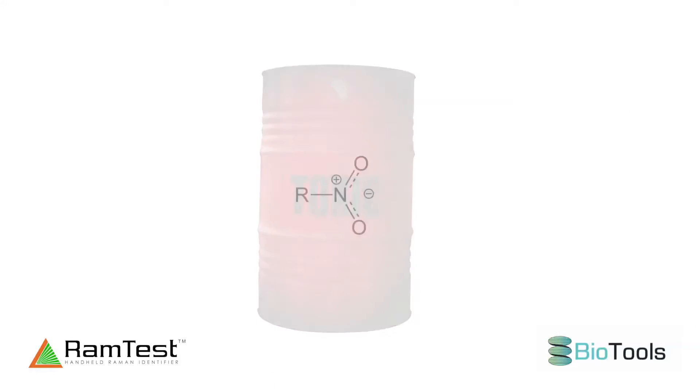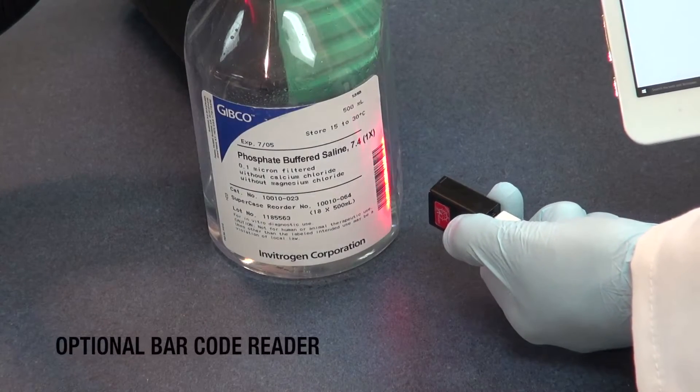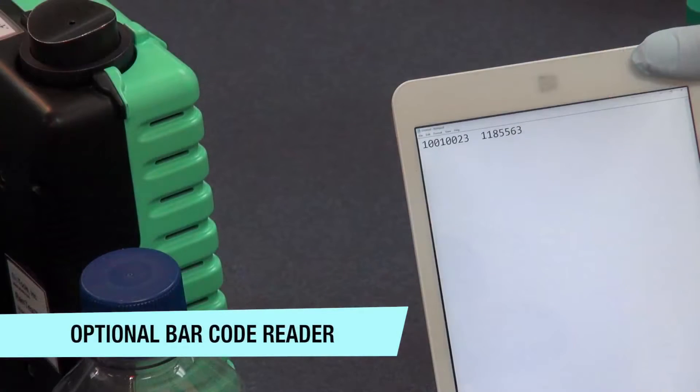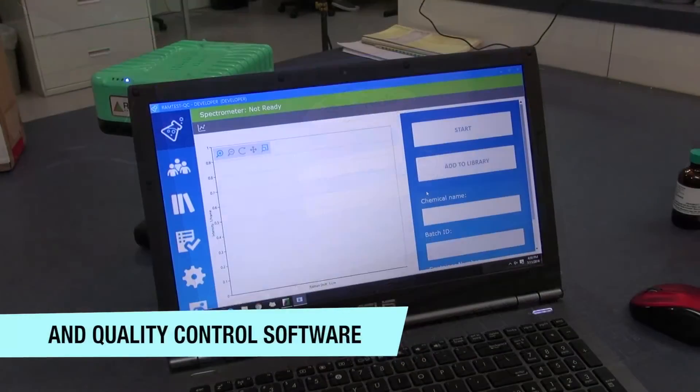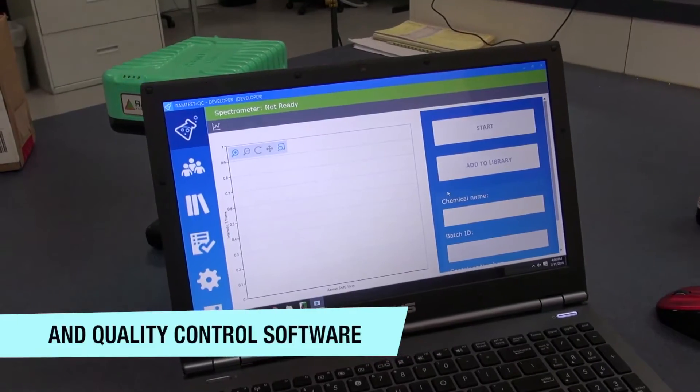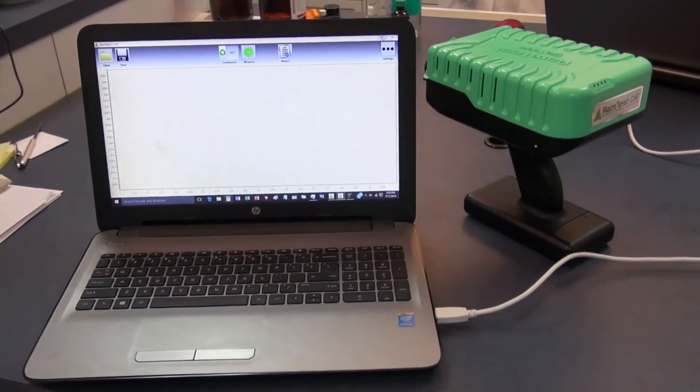Toxic solvents and nitro compounds. For field research and security work, you can identify raw materials right in the warehouse. With a battery life of up to six hours, you will save the time and expense of lab analysis.